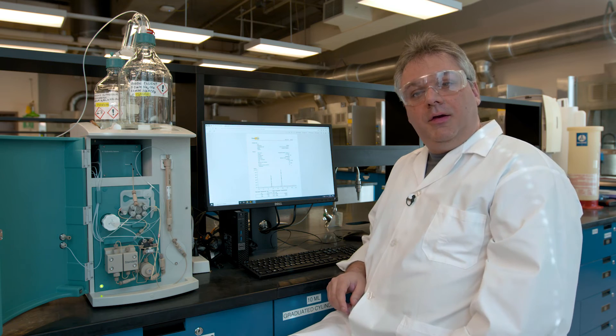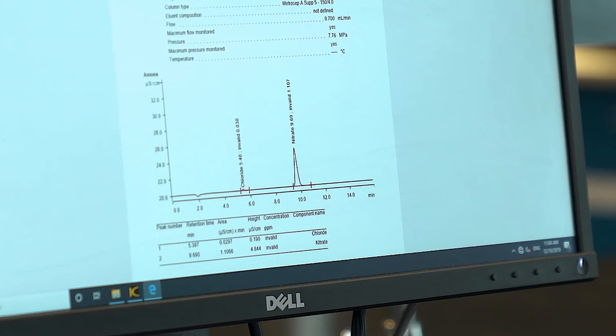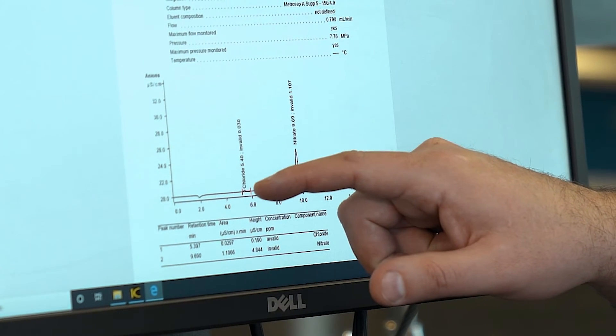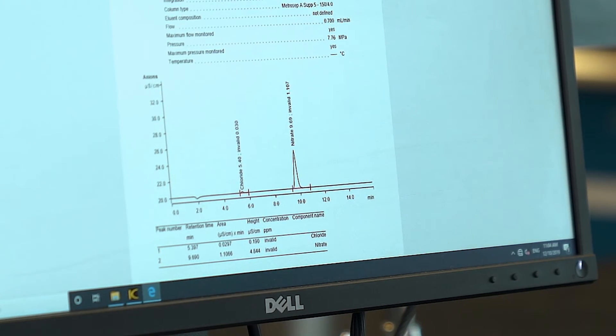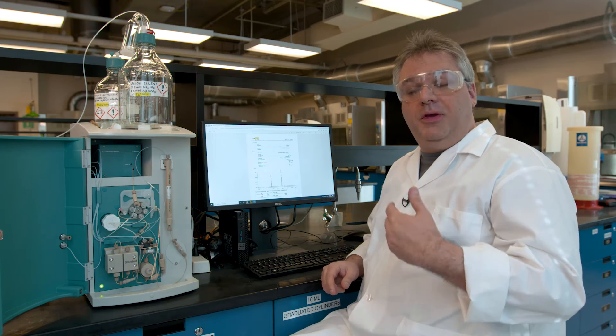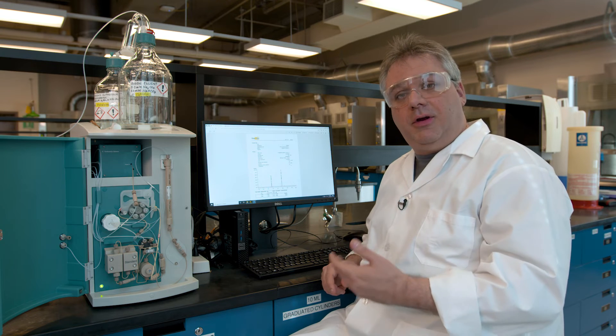All right, we're all done. So let's see what the results tell us. Along here is our chromatograph. Each peak along here represents a different ion. Depending on the sample, those could be fluoride, chloride, nitrate, or sulfate. The size of the peak indicates how much of the ion is present in our sample.